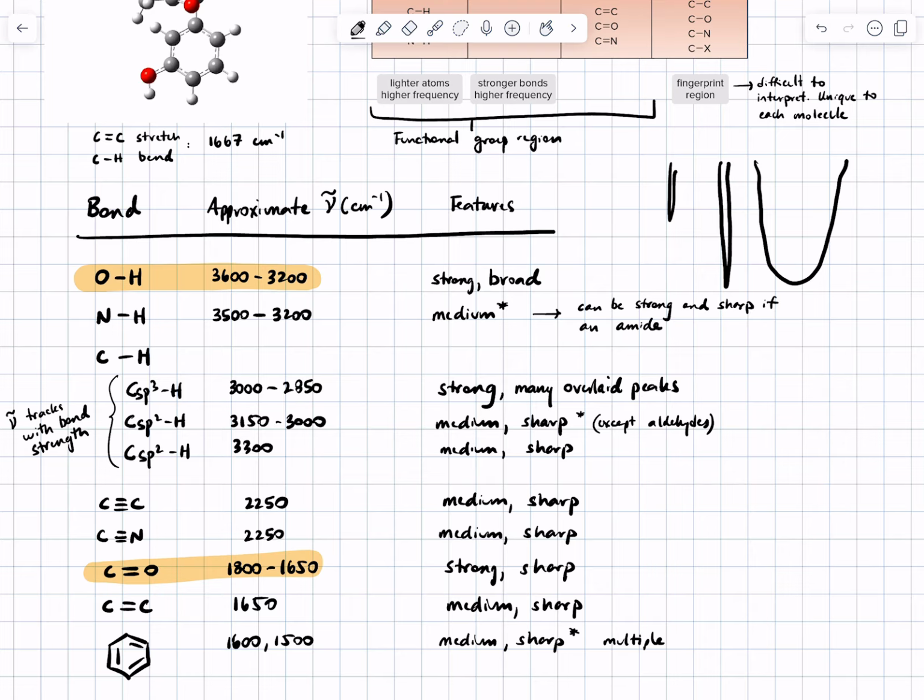By the way, you'll notice that I drew those peaks as valleys. What the heck am I doing? There is a reason for that that doesn't matter, but in IR, the peaks are all drawn negative like that towards the bottom of the page. The historical reason, I think I heard somebody whispering this, is that originally it's not absorbance but percent transmittance, what percent of light is getting through. So a peak means a low percentage of light getting through at that point.